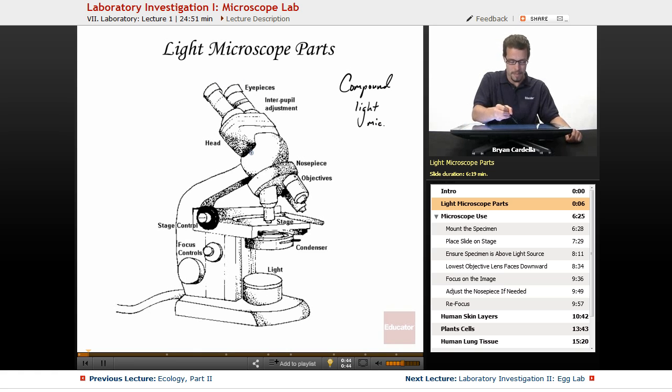So if we start from the top going down, you look into the eyepieces. Sometimes there's one, so you would close one eye and look in with the other. Sometimes there's two. Oftentimes there's this interpupil adjustment, meaning you can adjust the eyepieces. Sometimes you can spread them farther apart or closer together. You can also rotate the little edge of the eyepiece, which is a minor focusing. Now the eyepieces by themselves is times ten. So if you just have the eyepieces and you're looking at something, you're magnifying that object ten times.